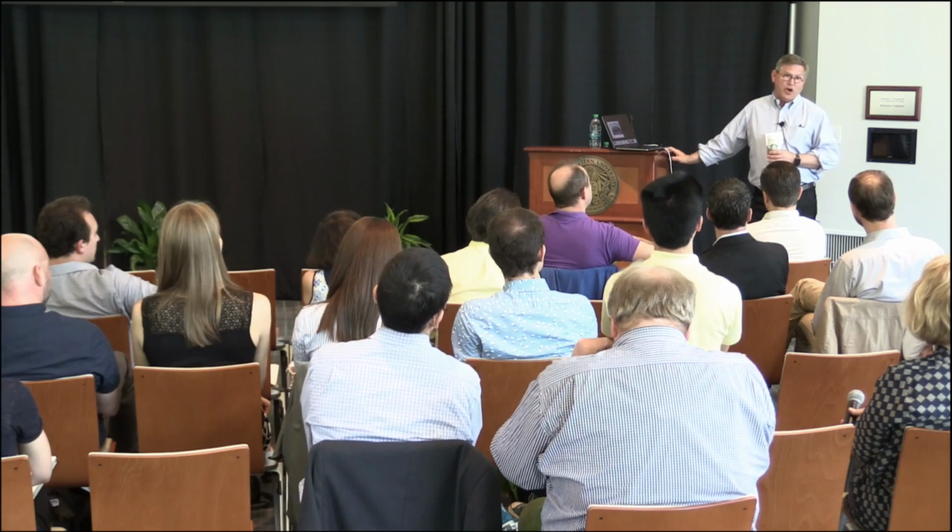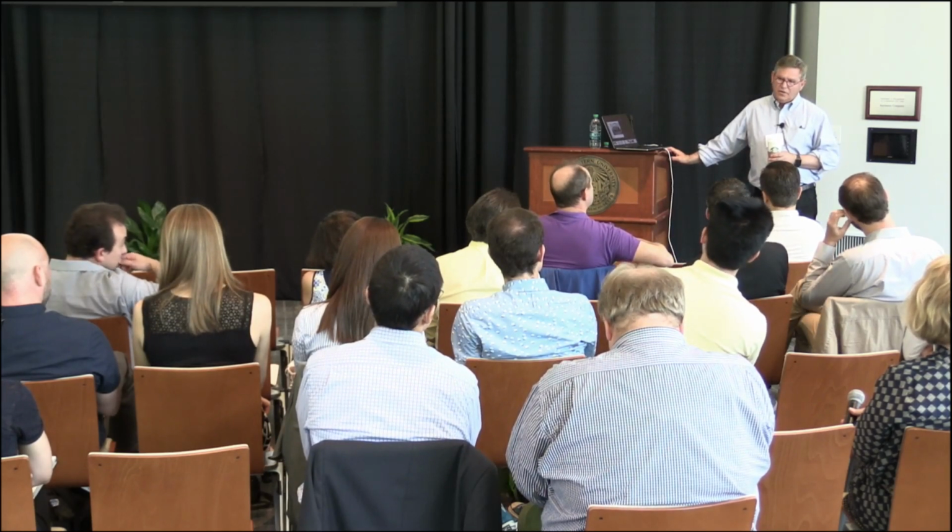And I would point out, when I was a grad student, I had this one spectrum that I could not interpret. I could not figure out what it was. Well, I eventually did, which is how I know this. It turned out it was a peptide with an oxidized methionine, and in the fast atom bombardment tandem mass spectrometry process, the sulfur fell off and it created an unusual amino acid. I couldn't figure it out because I didn't know what the original peptide was. What I collected was the MS/MS on the peptide that had beta-eliminated the sulfur oxide. So I couldn't interpret it because I didn't know what that thing was, and it took a long time for me to figure it out. There's probably a lot of that going on: oxidations that we don't anticipate, a lot of other modifications.